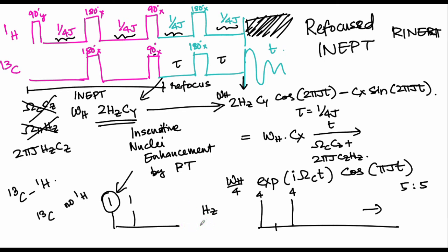I hope this module helped you understand how, when you are able to use the density matrix formalism, you are able to come up with some schemes where you generate a certain polarization that helps you enhance the signal sensitivity by the more sensitive nuclei. Basically, the rich person ends up feeding the poor person. The poor comes from the fact that the gyromagnetic ratio of carbon is lower than that of the proton. So you exploit the fact that the proton has higher polarization, which is taken in by the carbon to give a better sensitivity.